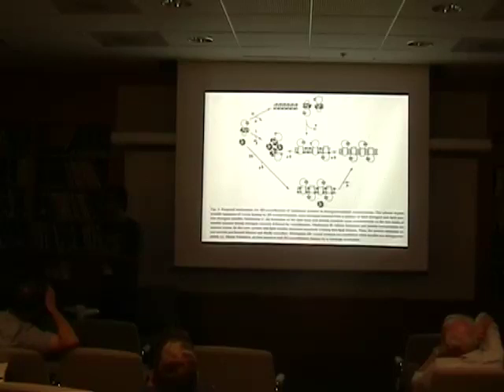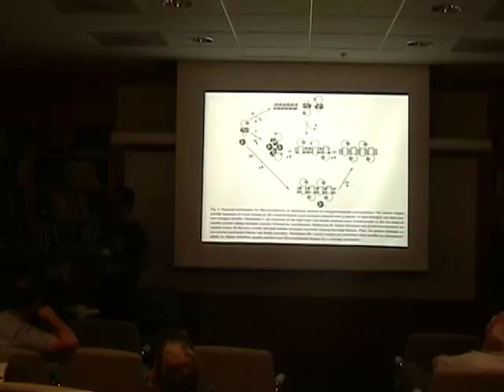In that case, I don't know. What I can suggest is that, since with dialysis you sometimes have protein on one side and lipid on the other, instead of adding solubilized lipid, you add liposomes, which means the amount of lipid that you need for the correct LPR, but added as liposomes, provided that you have enough detergent in the batch. So for example, your protein is in 0.1% DDM, which is largely enough to solubilize the amount of lipid that you need.